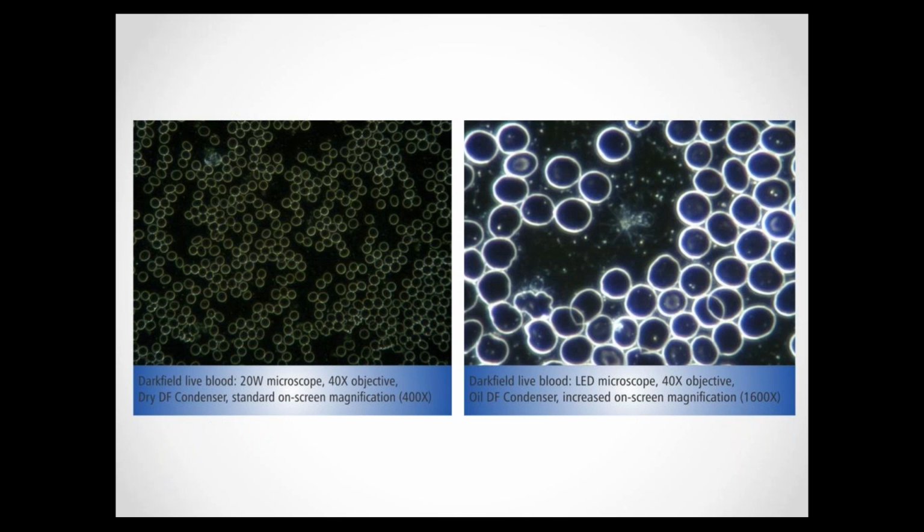Well, other than the build quality, there are a few other factors, and to discuss them, I'll have to get a bit technical here and resort to using some of the terminology used in microscopy. But I'll explain everything as we go along. So, firstly, let's talk about the objectives. On a microscope, the objectives are the lenses usually found just above the stage that provide and determine the different levels of magnification.